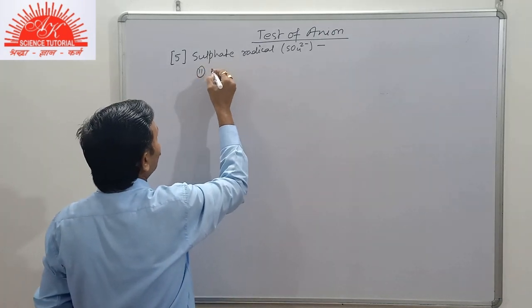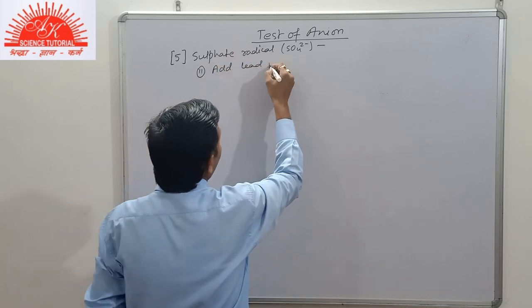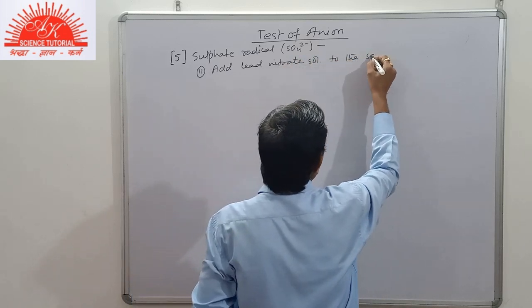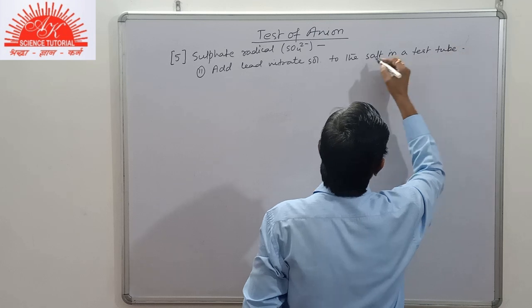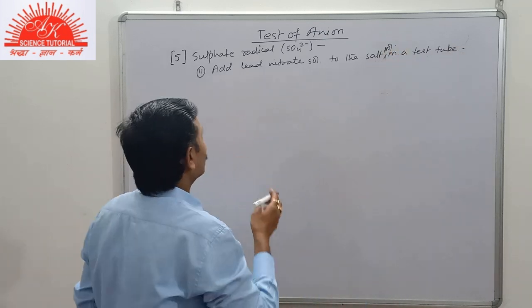Second test for it: add lead nitrate solution to the salt solution in a test tube.